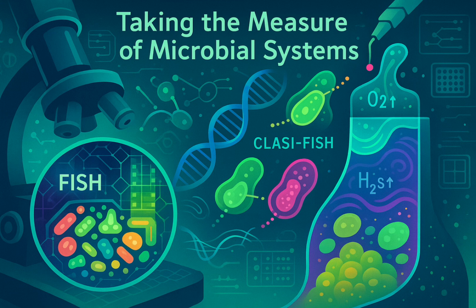Then you coat the whole thing with photographic emulsion, like old school film. The radiation emitted by the active cells exposes the emulsion right around them, creating tiny black silver grains. So you look for your fluorescent FISH labeled cell and see if it has silver grains clustered around it. Precisely. Silver grains mean it took up the radioactive food. No grains, no uptake. Again, identity linked to activity. You can even estimate activity level by counting the grains. The main limitation is having the right radioisotope available for your process. And Raman microspectroscopy, another single-cell technique.